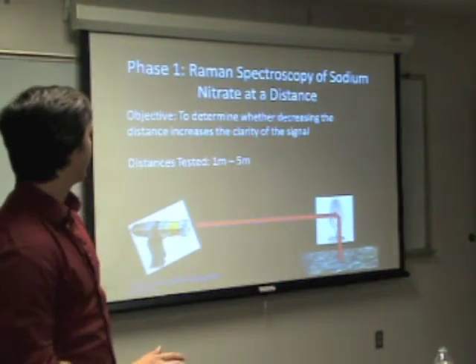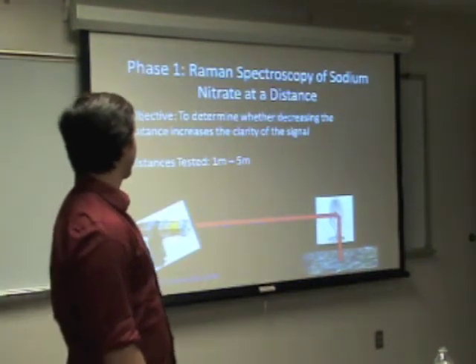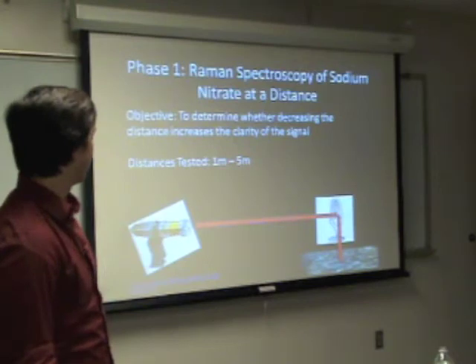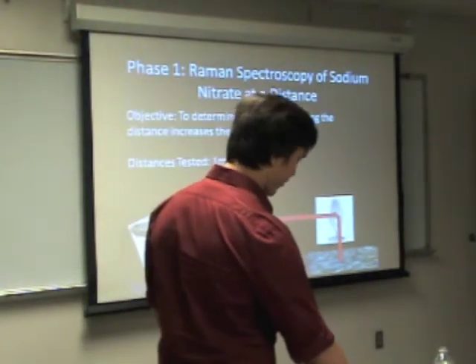Phase 1, the spectroscopy of sodium nitrate at a distance. Our objective was to determine whether decreasing the distance increases the clarity of the signal. Fairly obvious. We tested distances of 1 meter, 2 meters, 3 meters, 4 meters, and 5 meters.